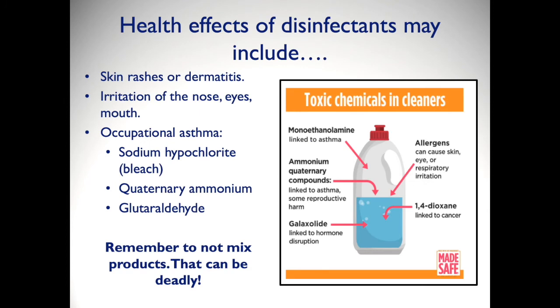Disinfectants do a good job to kill various pathogens and obviously also come with health effects. Health effects of disinfectants may include skin rashes or dermatitis, irritation of the nose, eyes, and mouth, and occupational asthma is associated with sodium hypochlorite, which is the active ingredient in bleach, quaternary ammonium, and glutaraldehyde. Remember to not mix products. That can be deadly.